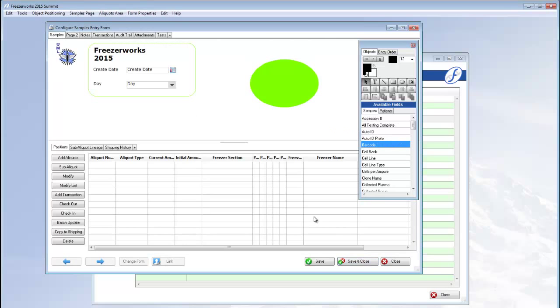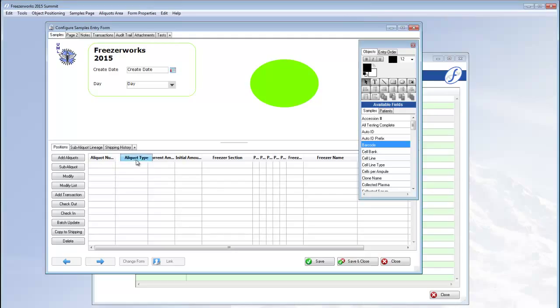Click save and close when you're done and notice how the fields you added to the aliquots form are now column headings in the aliquots area. They are in the order you added them, but you can change that order by clicking and dragging left and right.